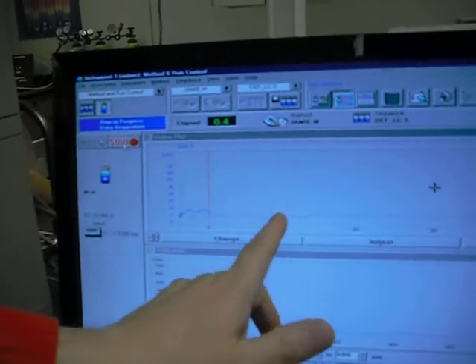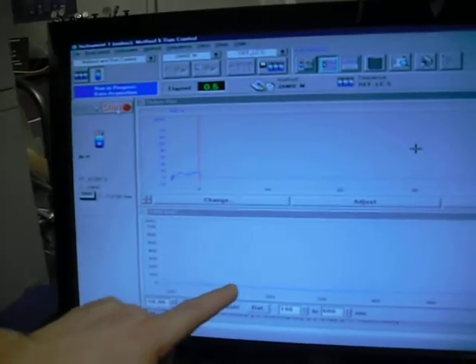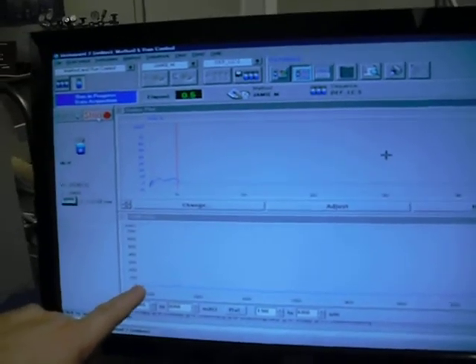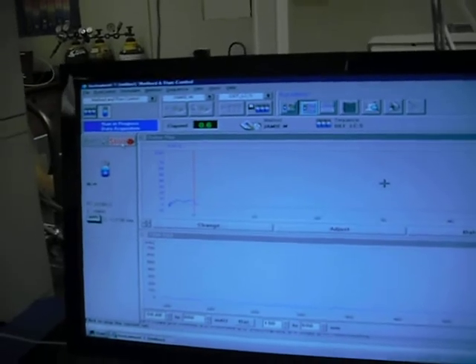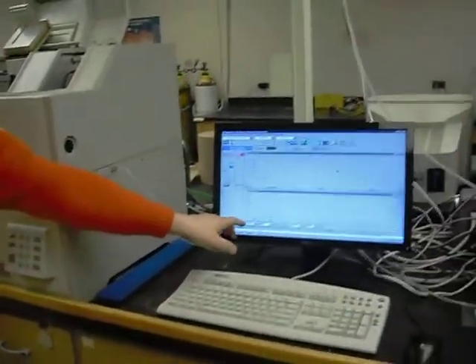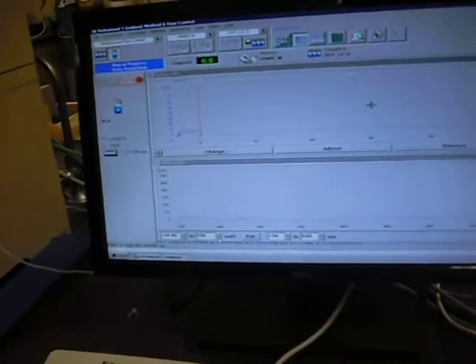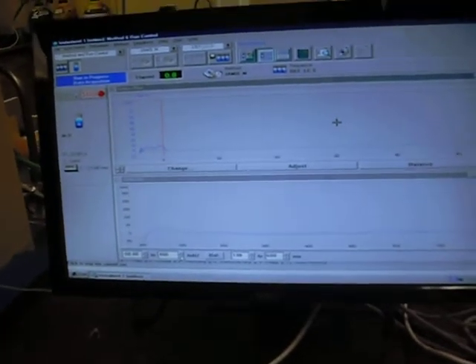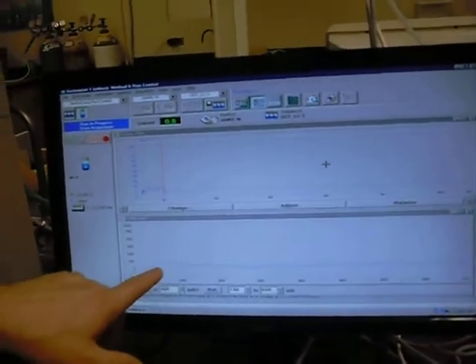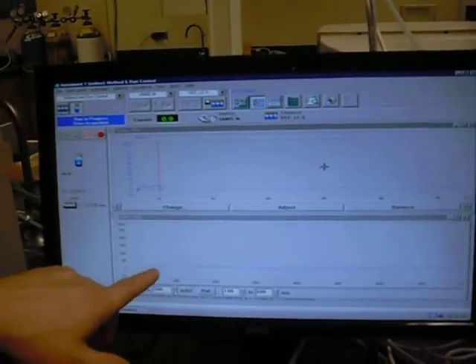appear on this time axis as the absorbance of the injected analytes begins to appear on the spectra as they are shown here. So the diode array detectors actually take a spectral snapshot every second or so, and you can see that. I'll increase the sensitivity here briefly so that as the trace analytes elute, we can see their spectra here.